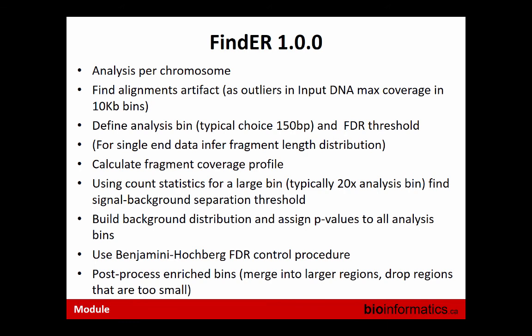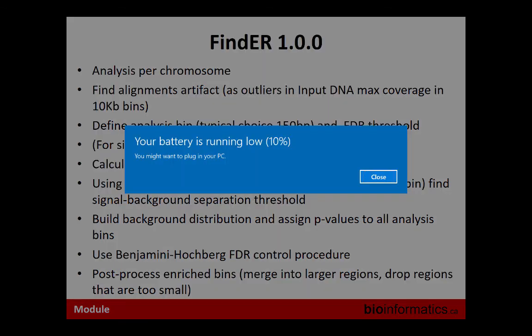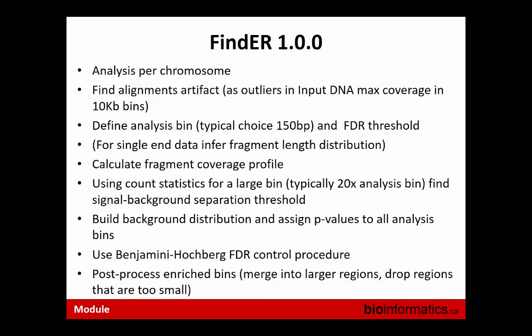Some of them are specifically designed for a single-end experiment, and they're using advantages, in quotes, of a single-end experiment. But this is just because people try to do their best for the analysis. Now, most of these tools use a limited set of data to validate their tools. And as a result, sometimes you fall into a trap of overfitting. You basically have, say, three parameters, and you adjust those three parameters in a way that your data is described best.